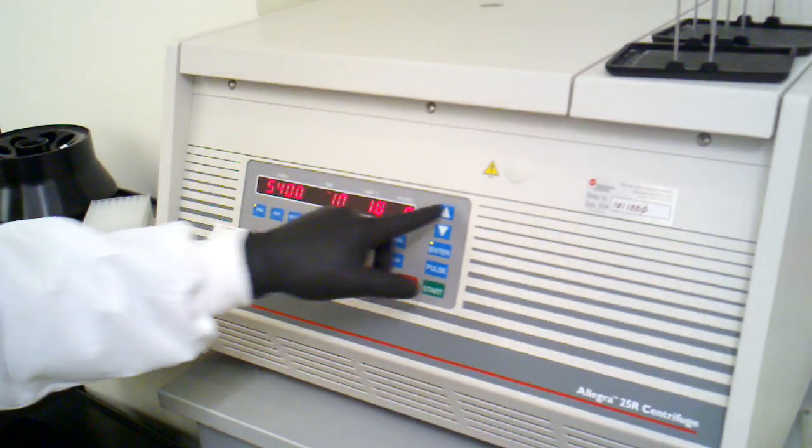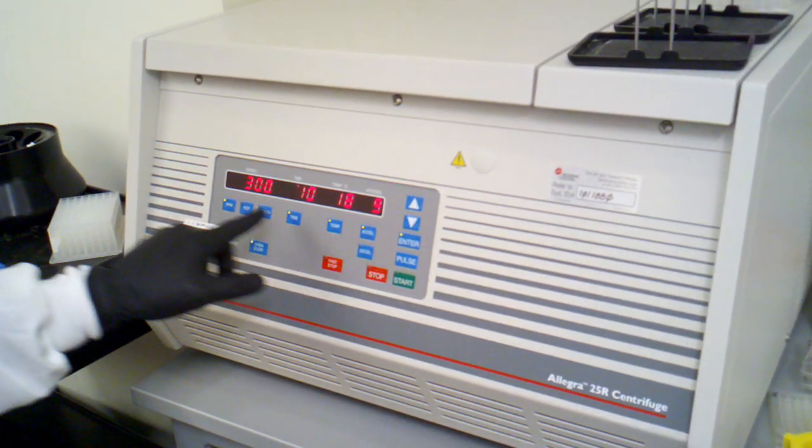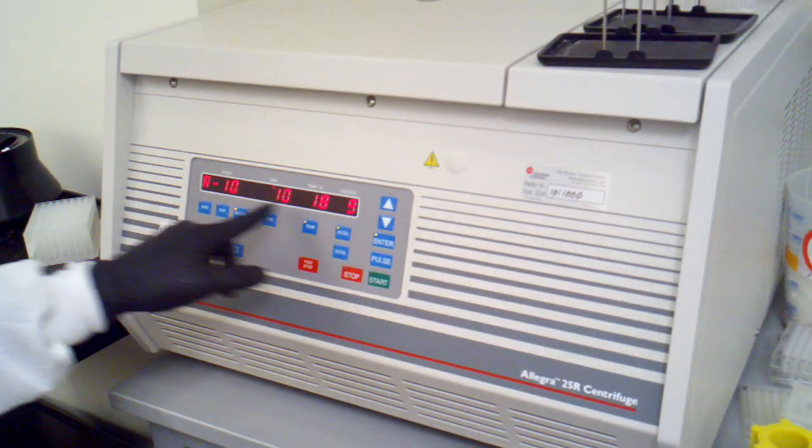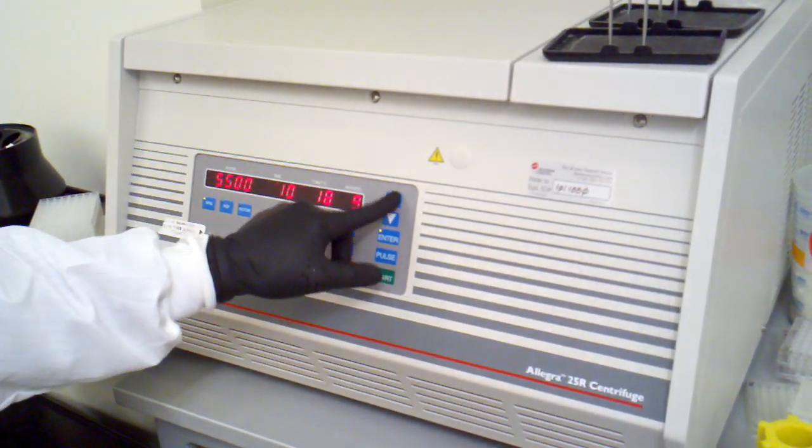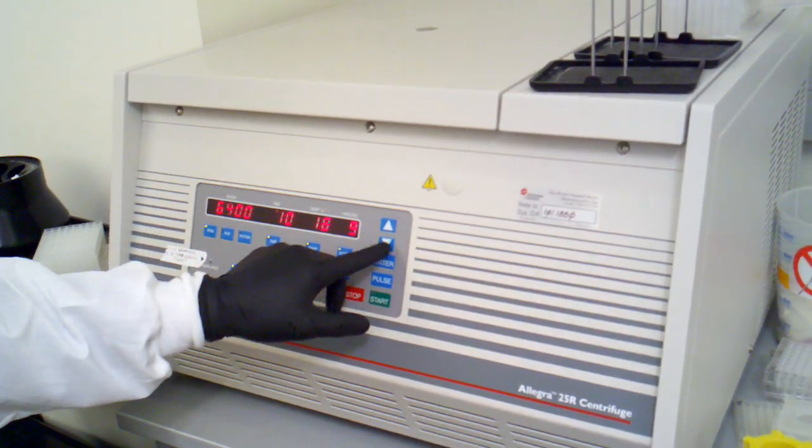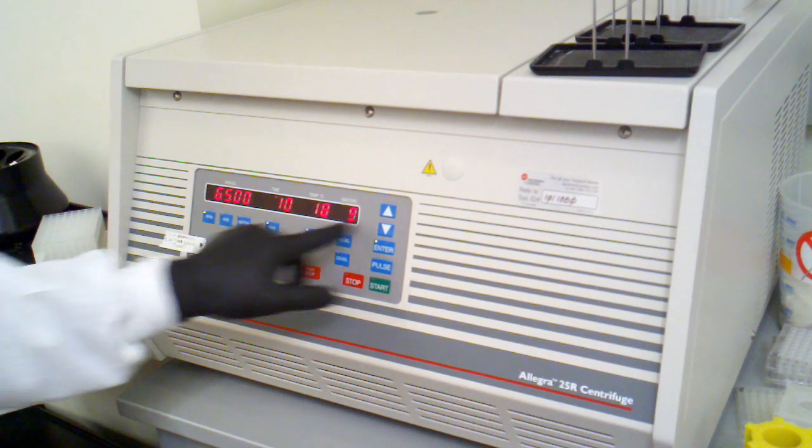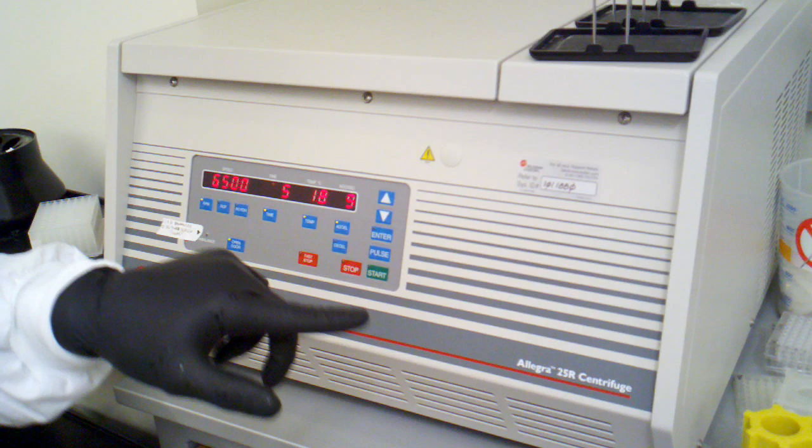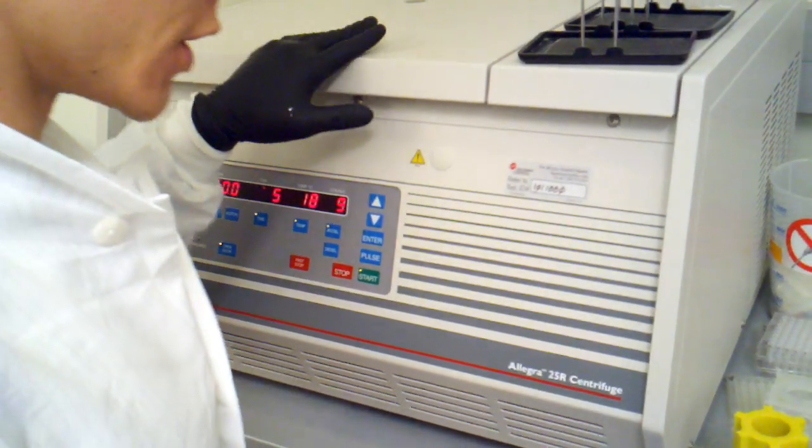RPM we're going to bump it up to 6500. That's because the rotor is wrong. We want TA10. RPM is going to be 6500. Time is going to be 5 minutes. And this should give us a nice little pellet.